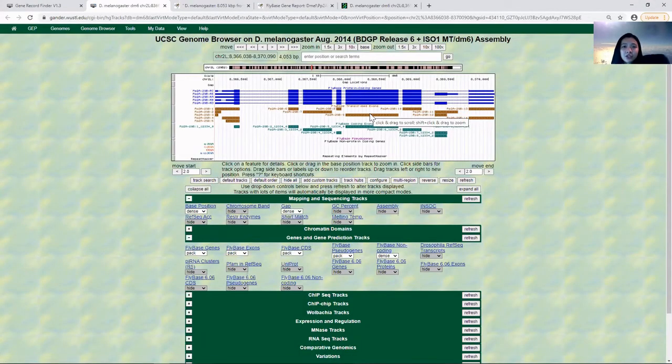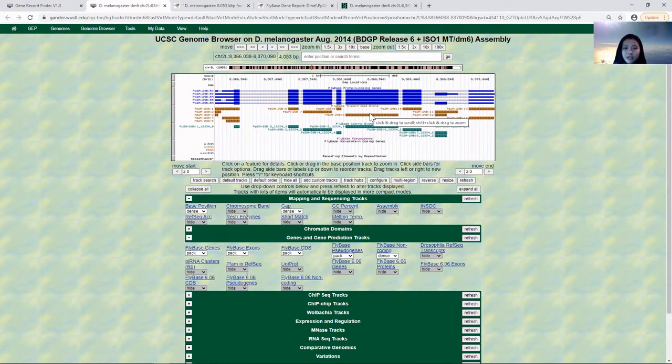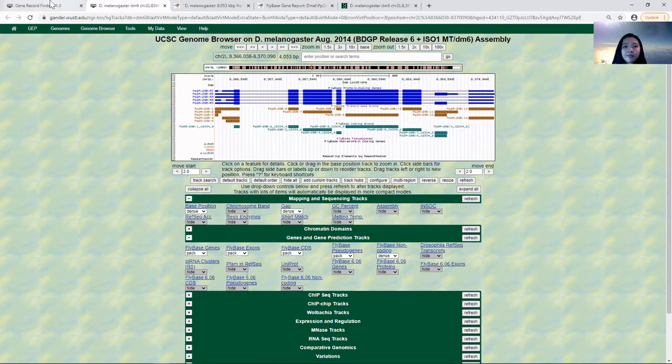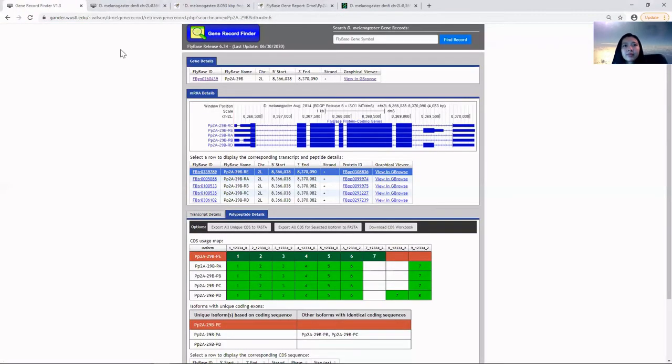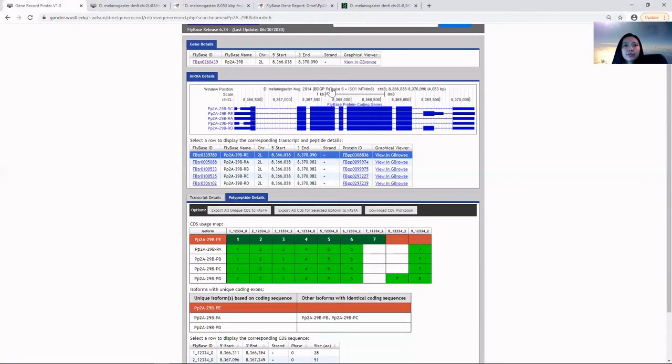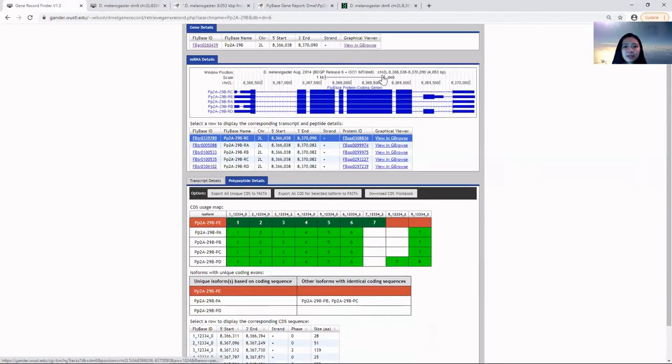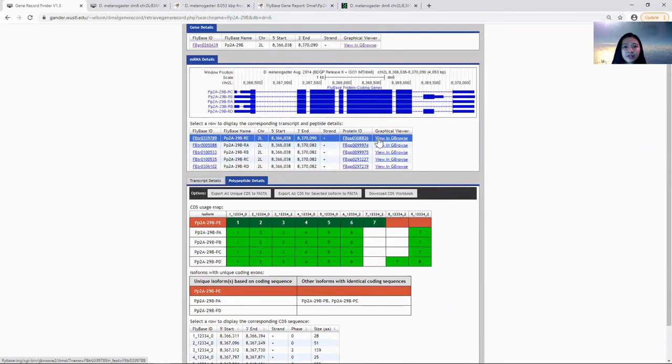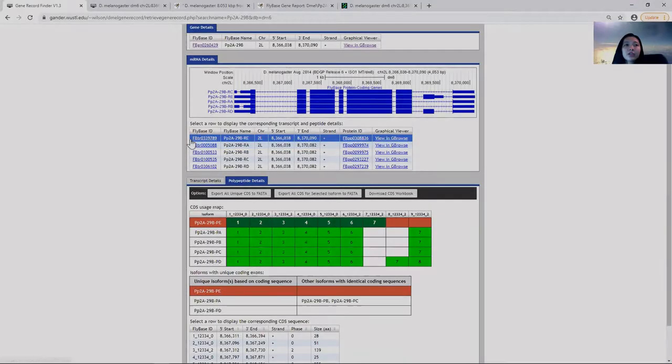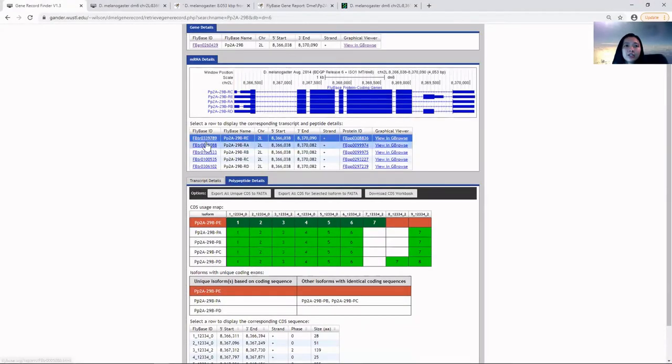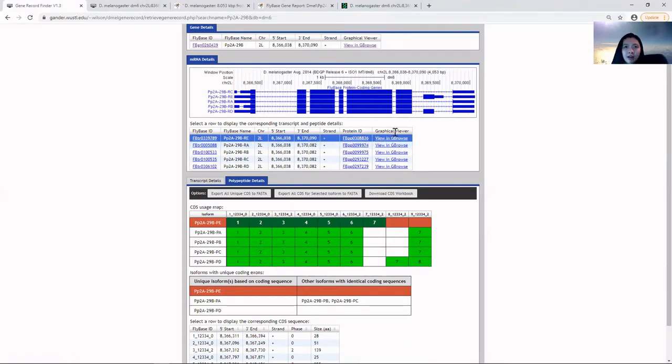This is a shortcut to allow us to view the gene in D. melanogaster in the genome browser. If you want to look at them individually, you can click on each of their FlyBase unique identifiers or their graphical viewer in GBrowse.